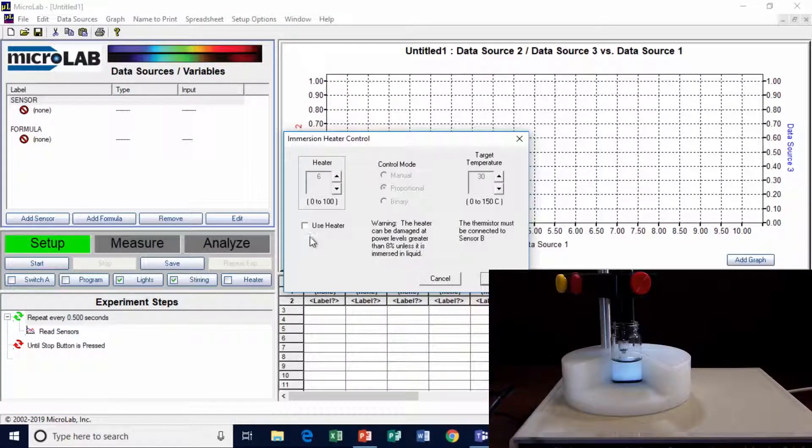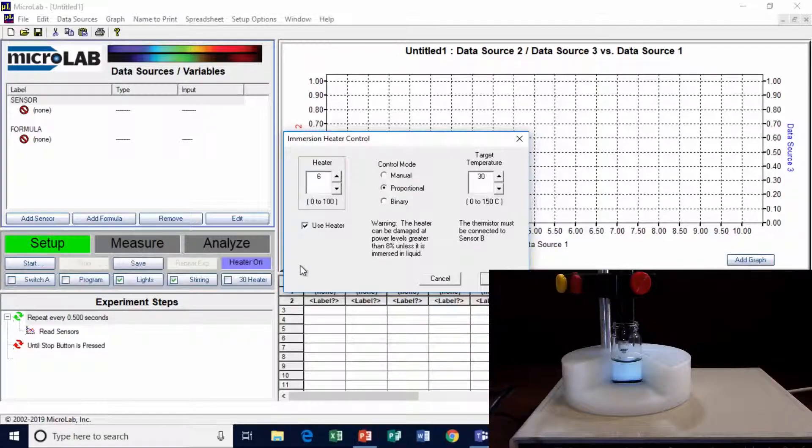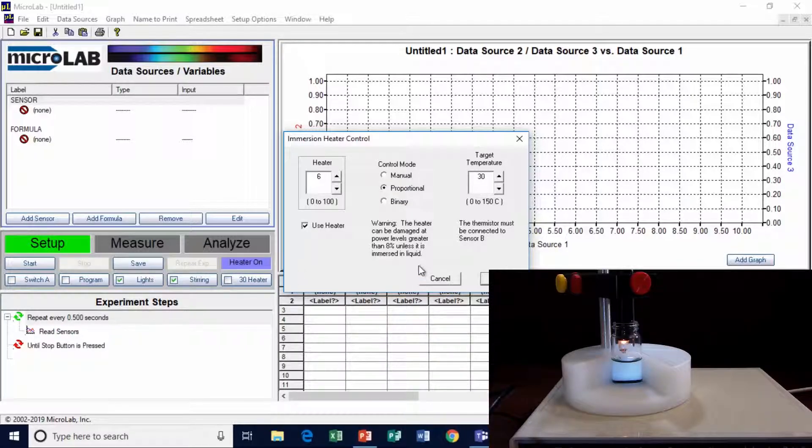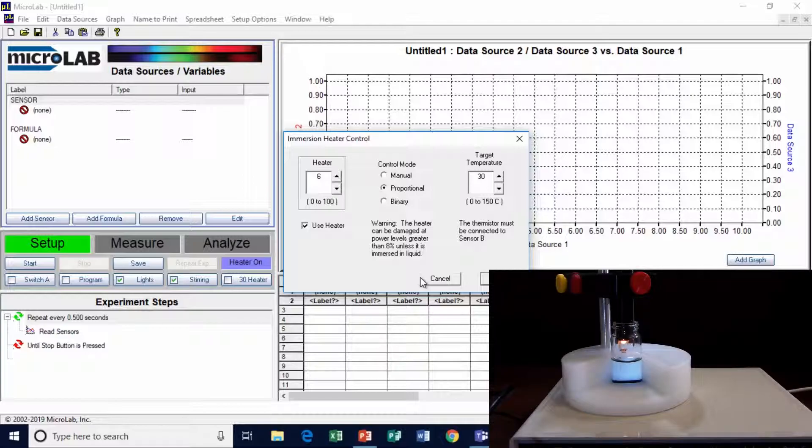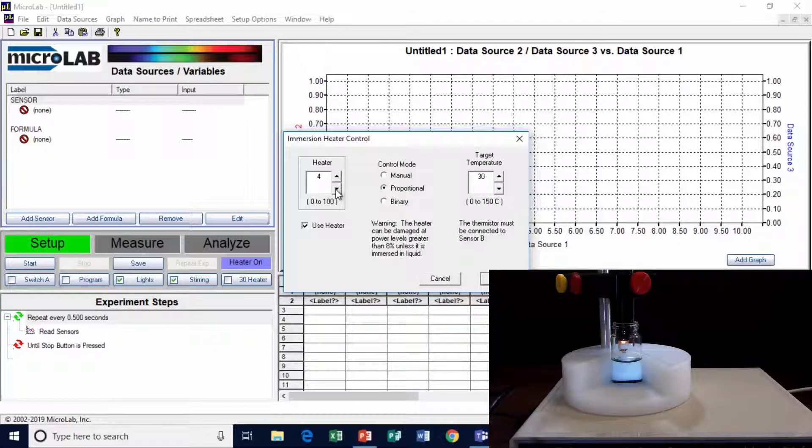The heater on, it says use the heater, and it says warning, don't run it above 8% unless it's immersed. This is an immersion heater, it's a glass bulb, so you can see what's going on. If it's immersed in water, the bulb will never get any hotter than the water, and it won't break.